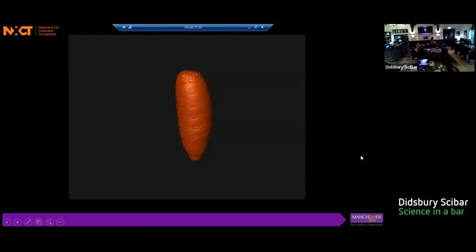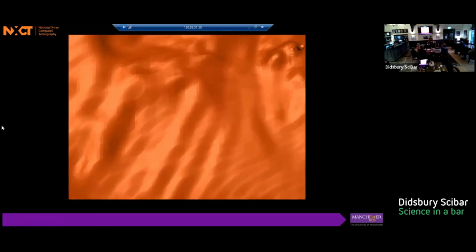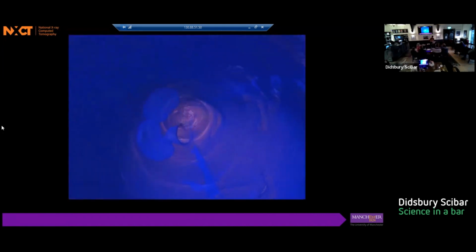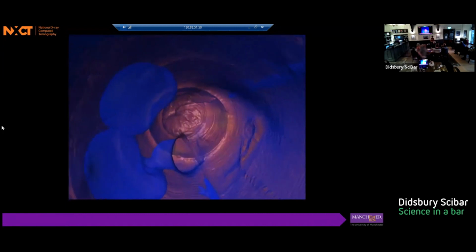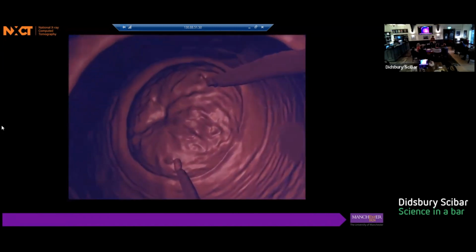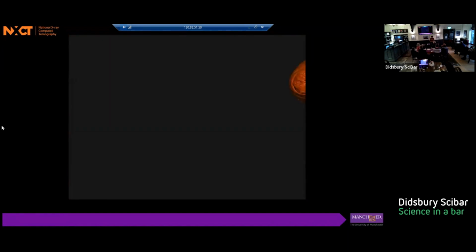But let's actually have a look at what this maggot looks like in 3D. Turns out maggots are basically just digestive systems. Who knew? Makes sense though. That's their job. Their job is to eat and eat and eat and eventually pupate and become a fly. So here's us flying sort of into the void, Star Trek styley, inside the digestive tract of this maggot. I'm not sure who made this video. It wasn't me, but I'm curious as to why they went for bright blue and bright red as the color scheme, possibly to distract from the fact that it's a maggot. But as you can see, it's a very nicely detailed maggot.